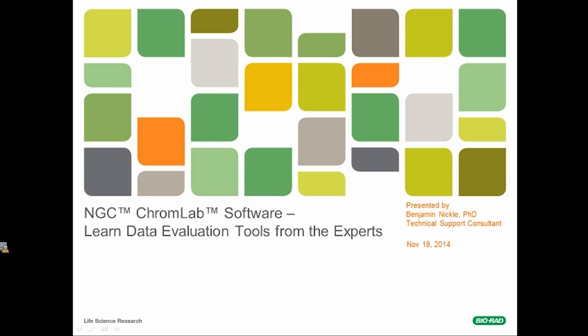Okay, so now let's begin. For today's presentation, we're going to be using version 3.1 of the ChromLab software. ChromLab is a software package that works with our Bio-Rad NGC system to develop, organize, and run chromatography methods, as well as collect and analyze the resulting data.